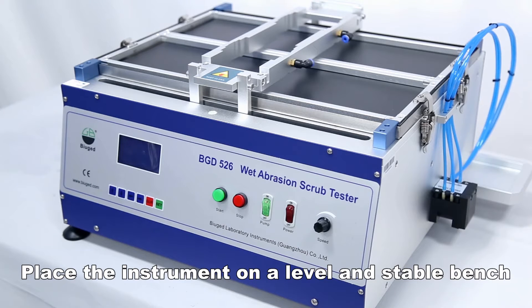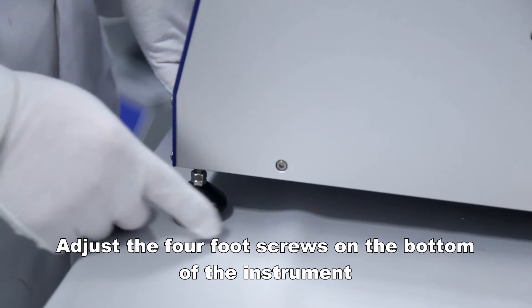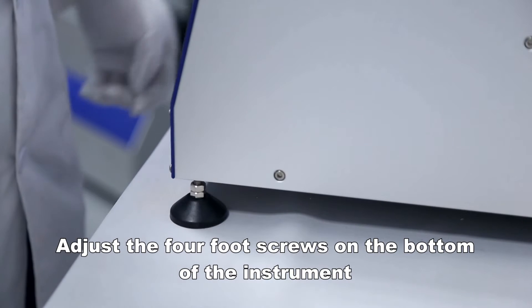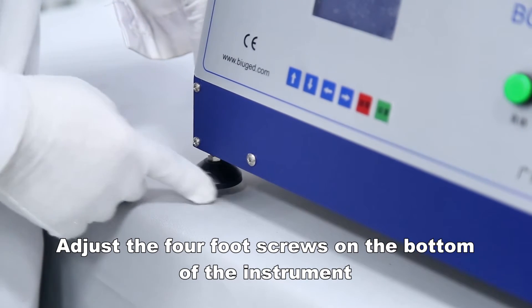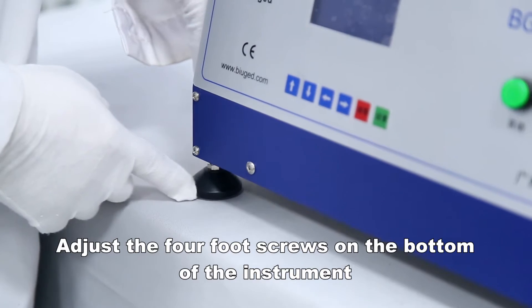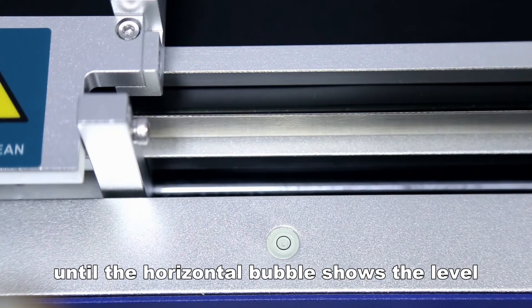Place the instrument on a level and stable bench. Adjust the four foot screws on the bottom of the instrument until the horizontal bubble shows the level.